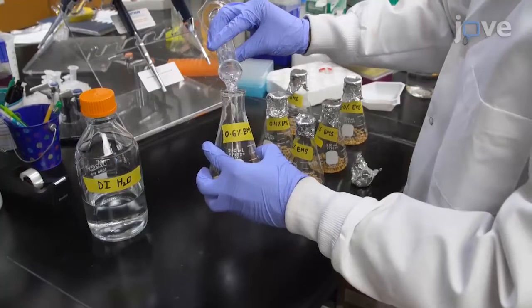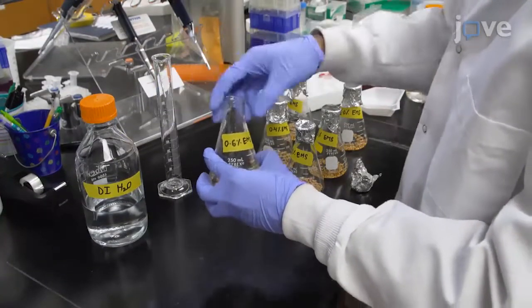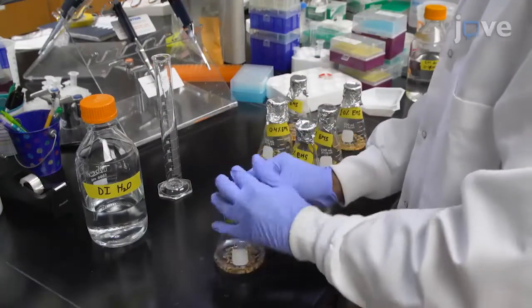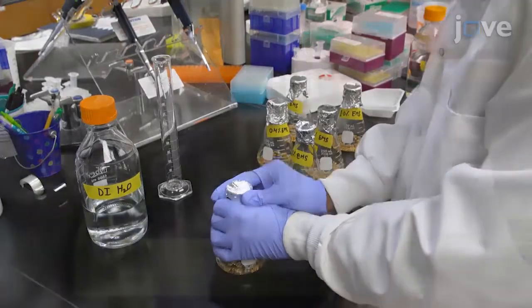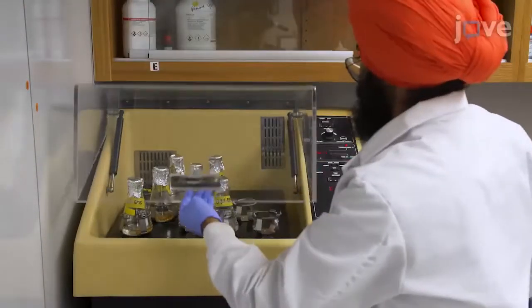To begin, soak 100 seeds with the genotype of interest in each of six 250-milliliter glass flasks containing 50 milliliters of distilled water. Shake at 100 rpm for 8 hours at room temperature for imbibition.